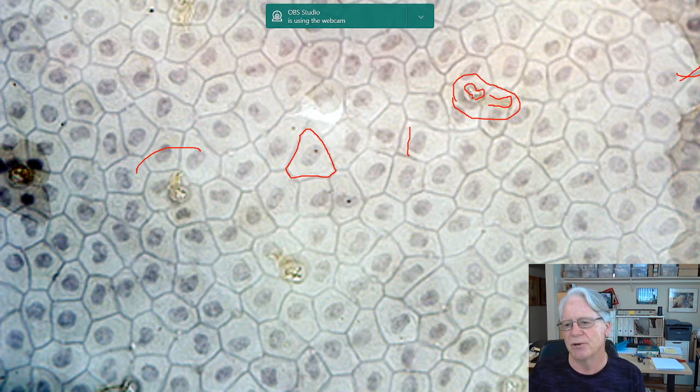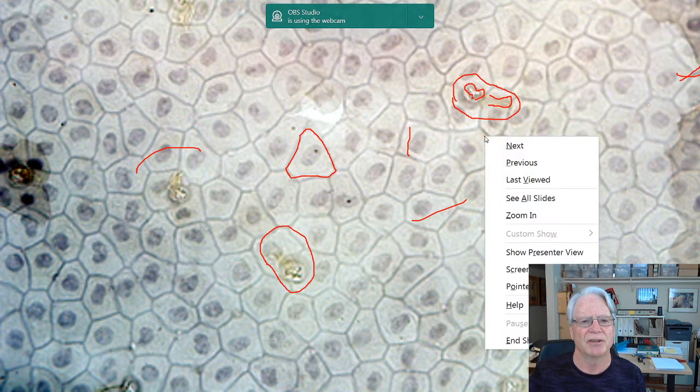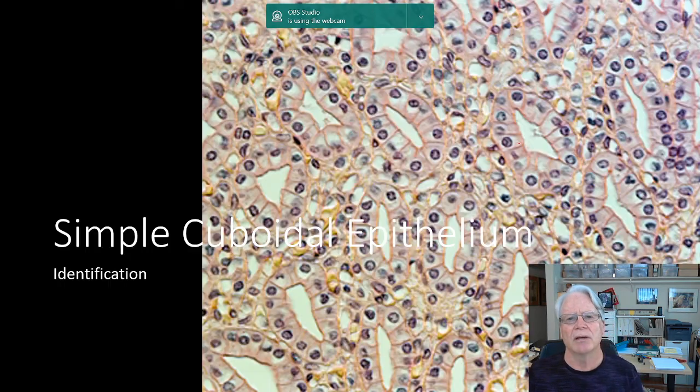Here in this corner, you can see here's the opening, and then here's the duct that leads down to some gland. So you can see it here too. Let's see, not there, but here. There it is. So you can see it here, same structure. It's just interesting. You can sometimes see things that are not actually related to what we're talking about, but are interesting nevertheless.